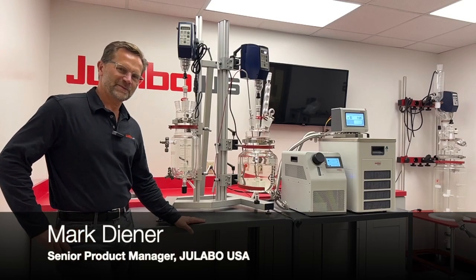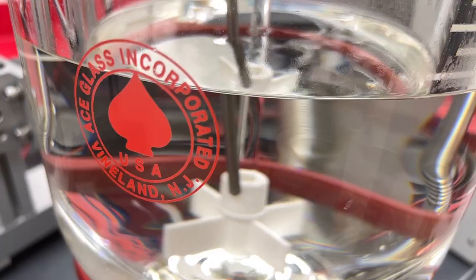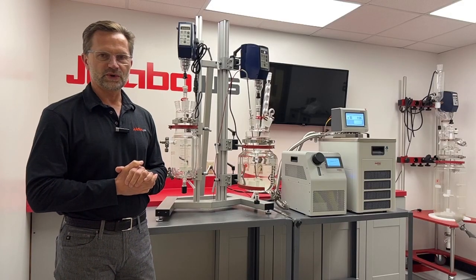Welcome to JULABO. I'm your host and today I'd like to talk to you about the double reactor stand from Ace Glass and pairing with JULABO temperature control units.